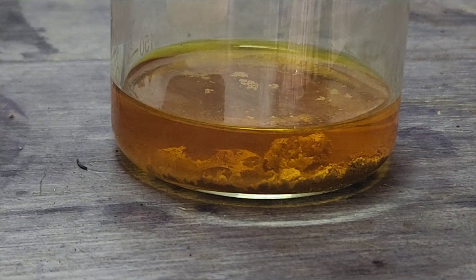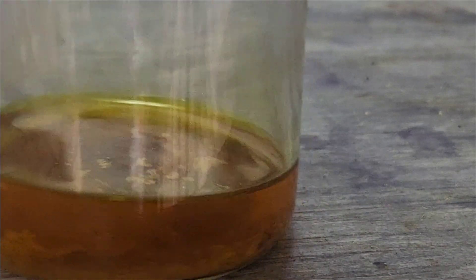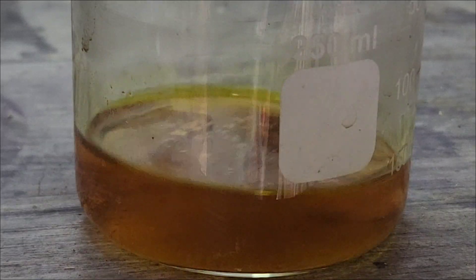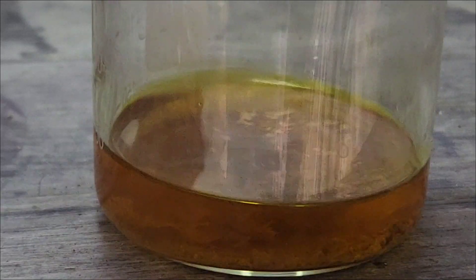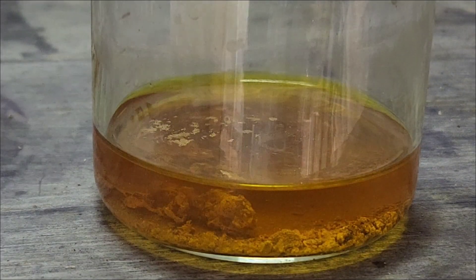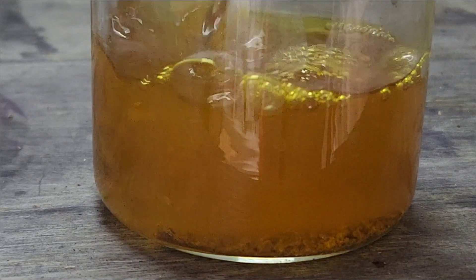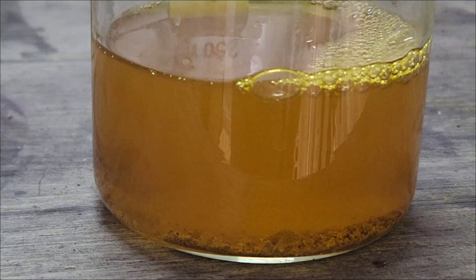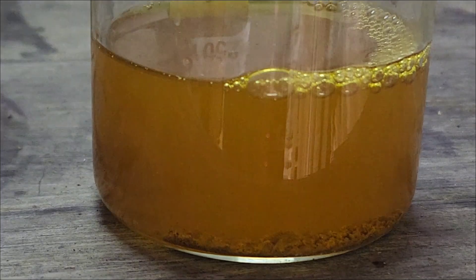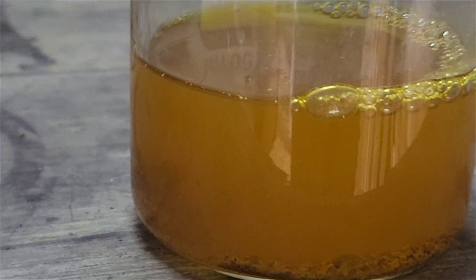So here we are back. Last night I dehydrated this solution so that we could bring the content down, because that hydrogen peroxide is going to contain a lot of water in there. I think we're at a point where we can go ahead and put a little bit more hydrogen peroxide in there, and put it back up on the heat.